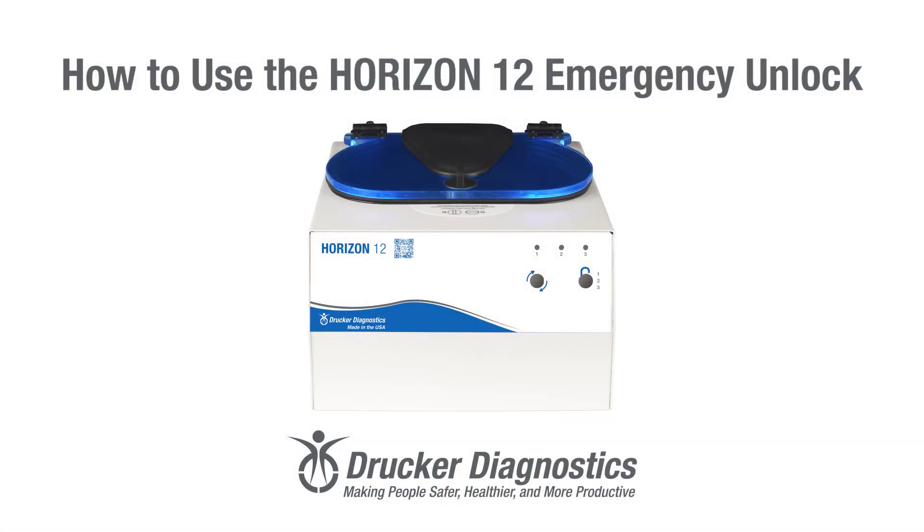Hi, I'm Dawn with Drucker Diagnostics and today we're going to review how to use the Horizon 12 Emergency Unlock.